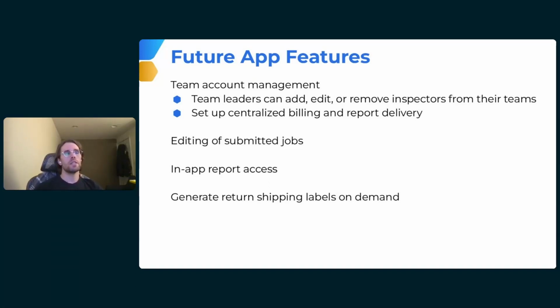Right now, if you send us a job and you hit that finish button, you can't edit anything in that job. And if you need to say, oh, I missed a sample, or I misspelled the client's name, or the address is wrong, you just have to email us or reach out to us and we can fix it really easily. In the future, you'll have the opportunity to edit jobs that you've submitted. That will be coming very soon, within probably the next handful of weeks.